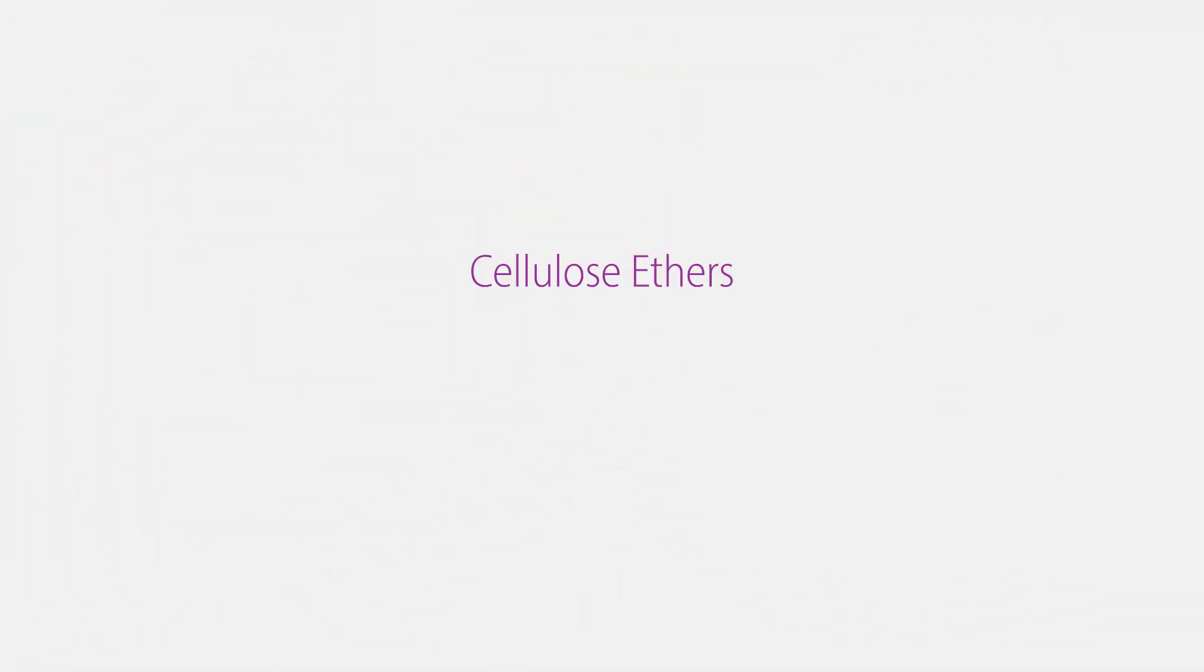This video is about cellulose ethers and their applications in paper conservation. It is shown how to prepare them and what needs to be taken into account.